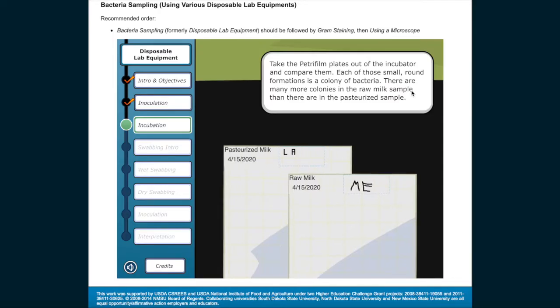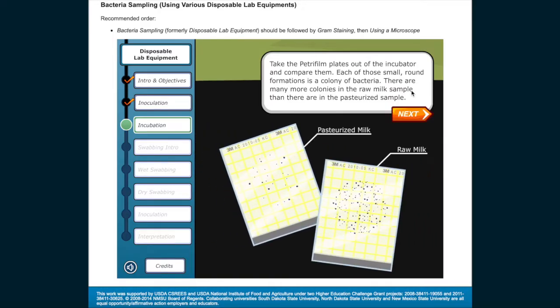Take the Petri film plates out of the incubator and compare them. Each of those small, round formations is a colony of bacteria. There are many more colonies in the raw milk sample than there are in the pasteurized sample.